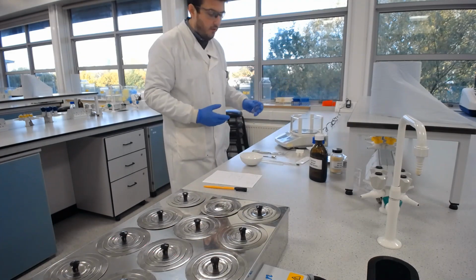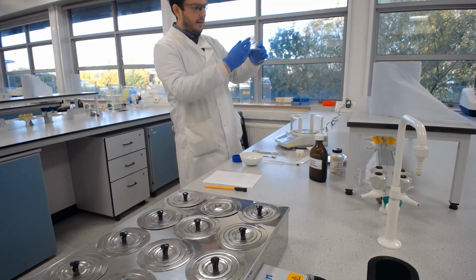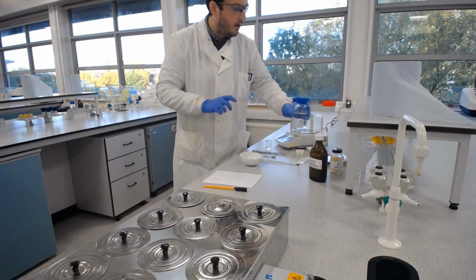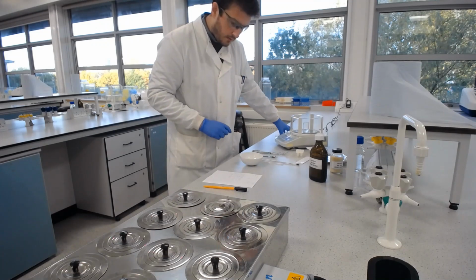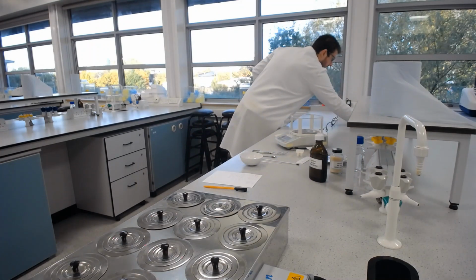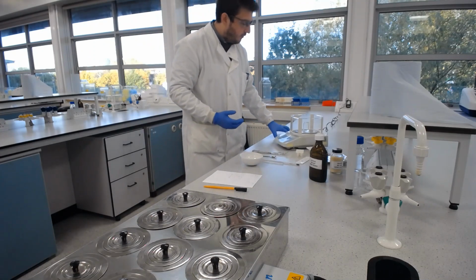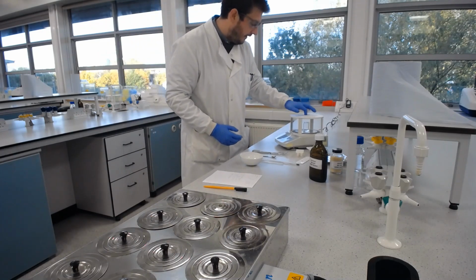Now we don't weigh things in directly onto the balance, so I'm just going to pour directly into that beaker outside. I've got too much in there, but remember we don't ever put things back into the original container, so if I want to get rid of that, I'm going to pour a little bit down the sink, but let's just see how much I've got. So I've got 5.5 in there. I don't want quite that much, so let's get rid of a bit. Incidentally, it doesn't matter if you have slightly too much, it will just take you longer to evaporate off the excess water. I've got about 4.5 grams of water in there, 4.5 millilitres, so slap bang in the middle of where I want it. So that's fine.